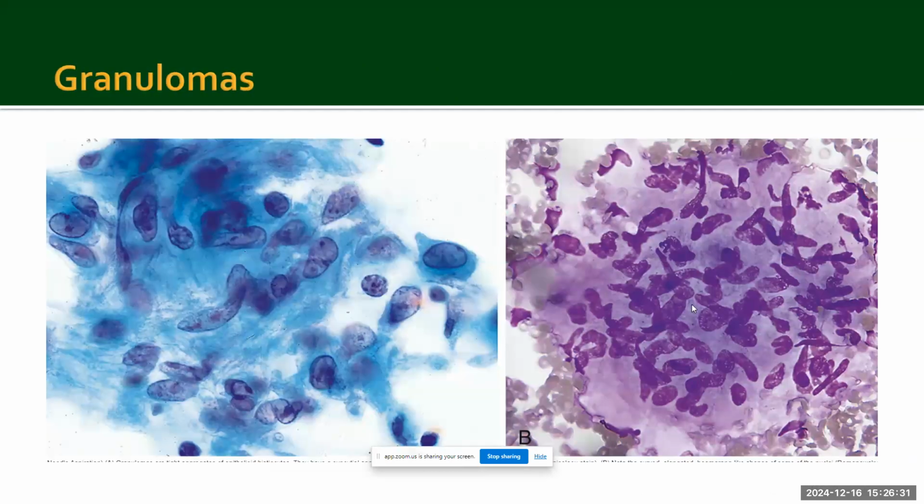Wow, those Creola bodies can really look scary. Yes, they definitely can. Okay, so let's move on to our next question.